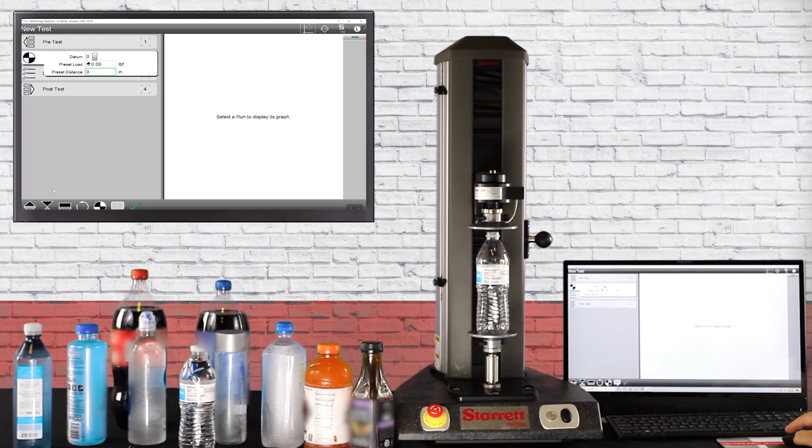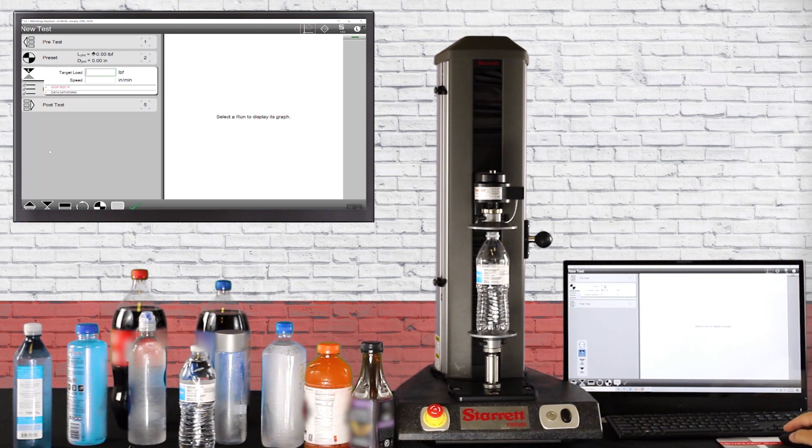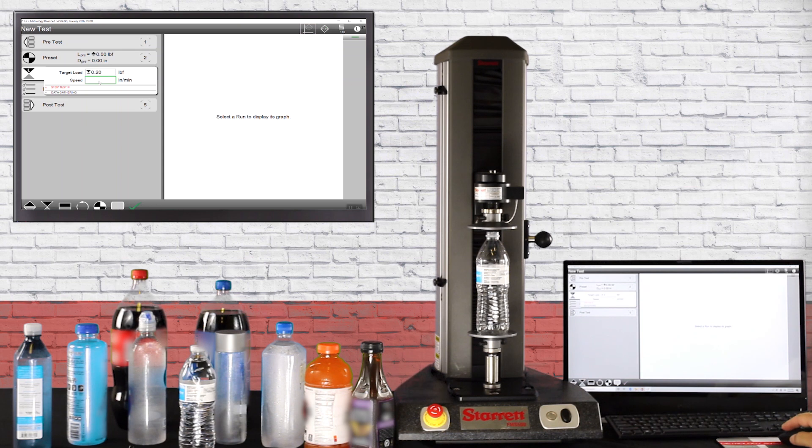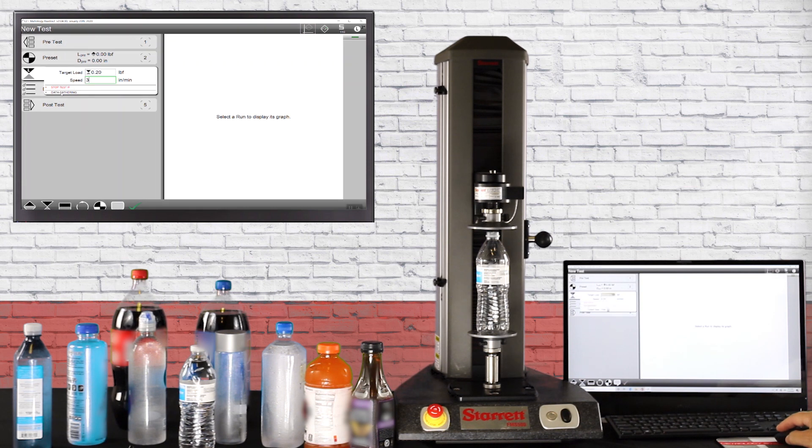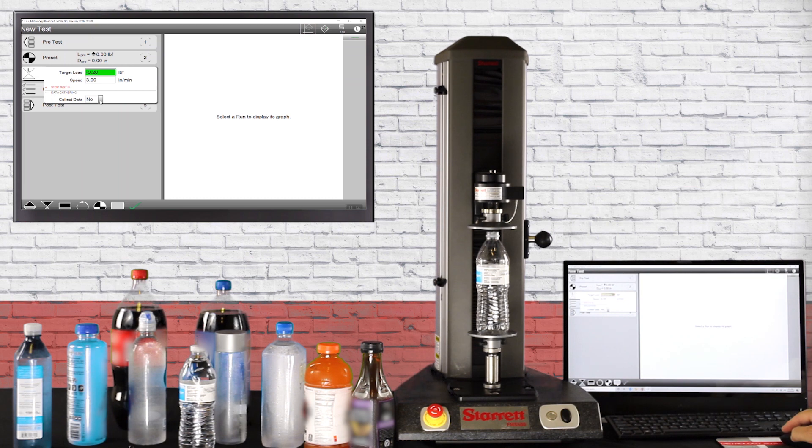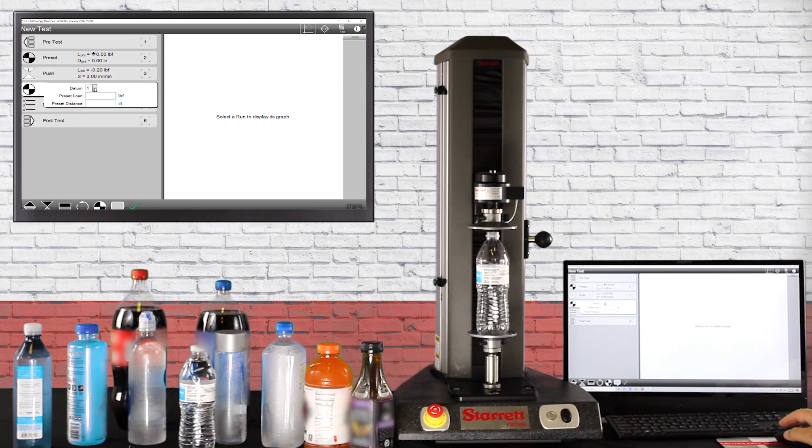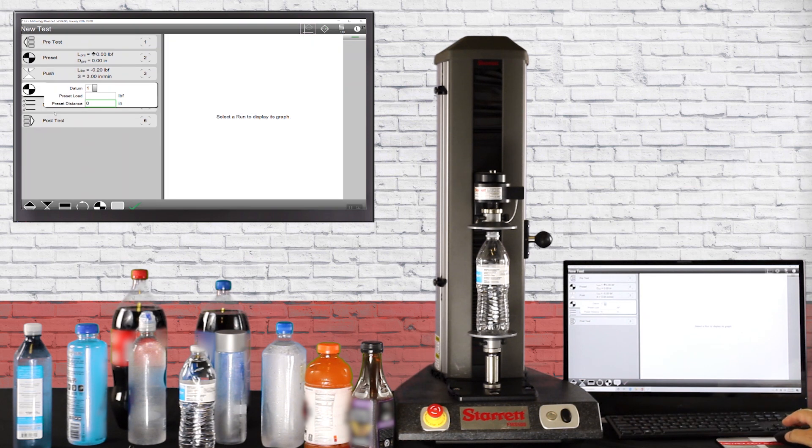Next we're going to come down and go to a load. We're going to go to a very light load, 0.2 of a pound at three inches a minute. Down here where it says data gathering, we're going to say no data gathering. All this is going to do is allow us to move down and touch off on the top of the bottle. Next we're going to do another datum. After we touch the top of the bottle we want to zero out our distance so we're going to put a zero in there and call this datum one.